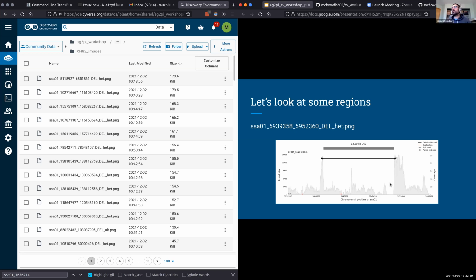Yeah. And also another reason why this might have passed the filter is because when we computed high coverage regions, we used a very large window size in this particular case, just to make sure that it runs as quickly as possible for demonstration purposes. But if you choose smaller window sizes, you might be able to catch something like this a little bit more easily, because the average coverage across this genome should be around 20 probably, whereas this is going to be more than 4 times the standard deviation above the mean if we had used a smaller window to create our exclude region.